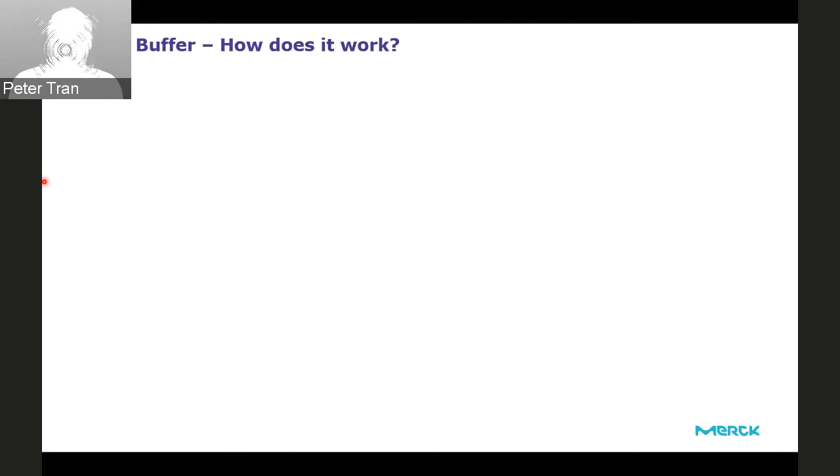What buffer do you use for extraction? Always RIPA buffer, commercial buffer, optimize the buffer by yourself, or follow the publication for the target protein. Just pick one and vote. I'll give you a few seconds to do this.